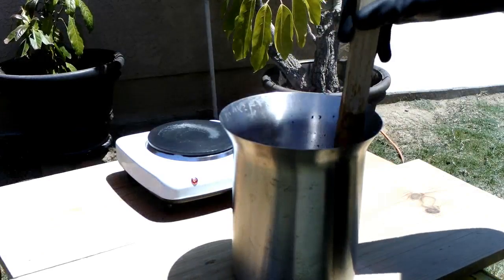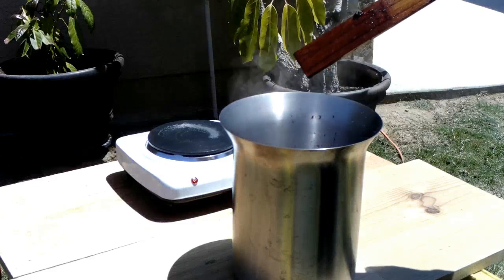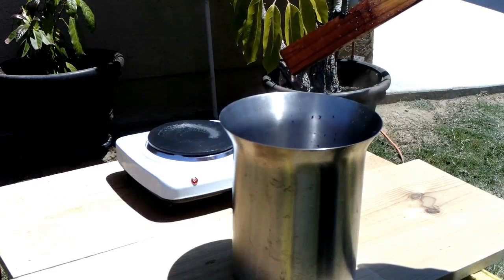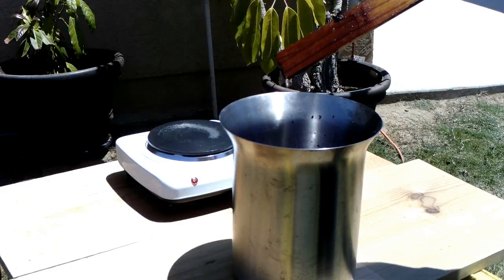I probably should have kept better track of the amount of time I spent making that batch of sodium silicate. It was well over two hours, probably closer to three. All of that time and effort for a little more than a quart of water glass.